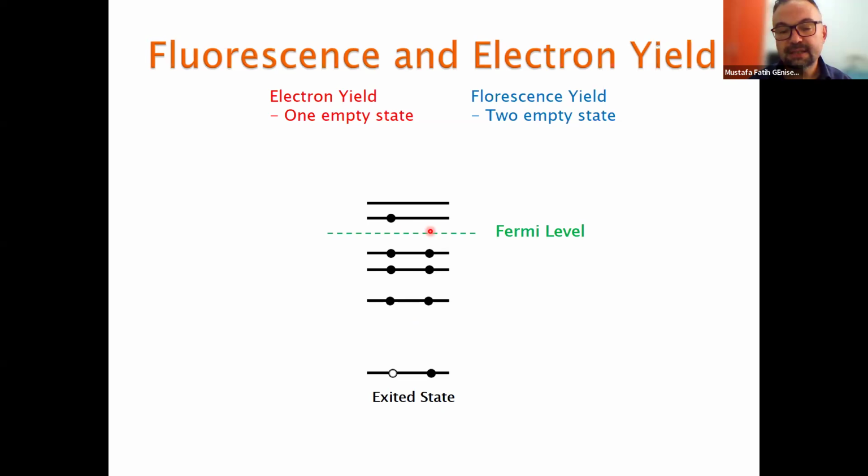Normally in hard X-ray, they can understand this from the difference between the intensity of the incoming photon and the intensity of the outgoing photon. But again, this is not working in soft X-ray because photons cannot pass through the materials, they are absorbed by the materials. So what is going on? We are chasing other things. What's going on with absorption?